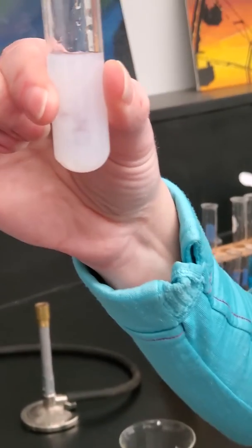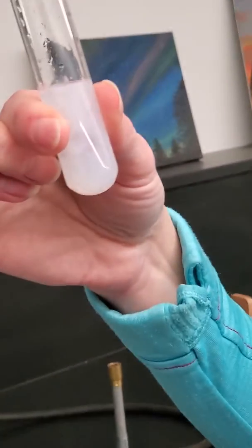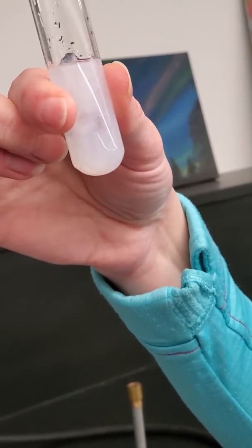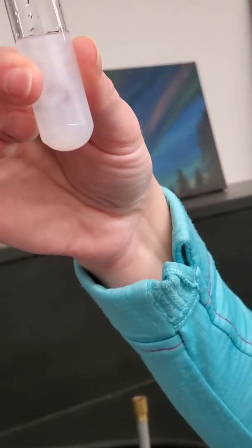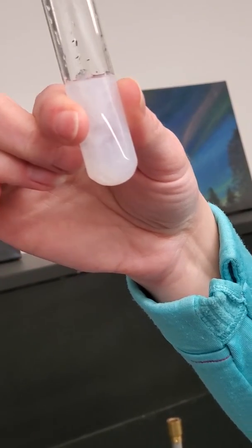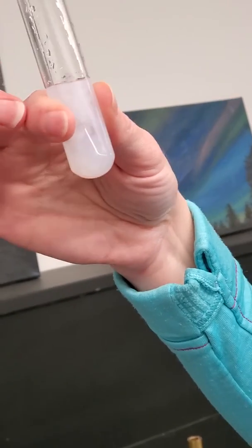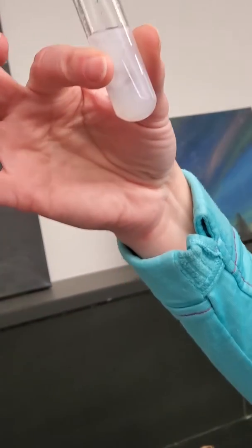It's kind of a weird word for solid, but in chemistry we use the word precipitate when solid is formed out of 2 aqueous solutions. It's different than when we think about precipitation like rain. Rain is liquid coming out of gases. This is solid coming out of liquids. It's falling kind of like rain.